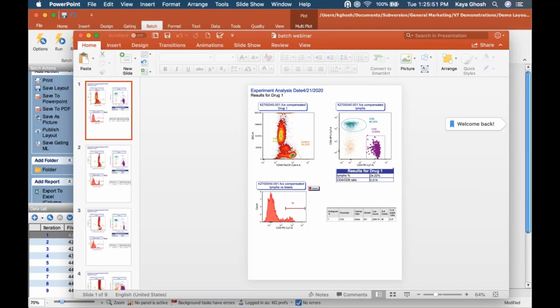Somebody asked, is there a difference between data-specific gates and iteration snapshots? You could use data-specific gates during batch processes. That's fine if that's what you're used to using. They'll both function the same way as would iteration snapshots. Okay, data-specific gates was designed for something a little different, and I see Raphael is answering that in a little more detail. So thanks, Raphael.